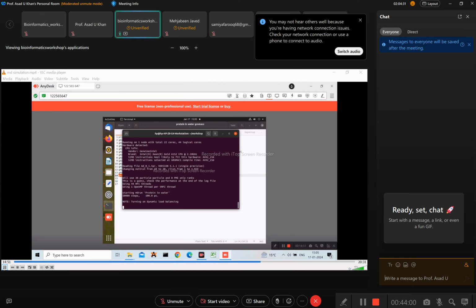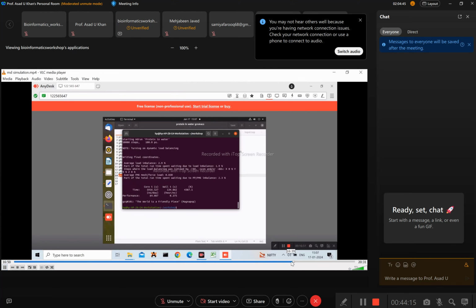It will also take some time. So yes, now it is completed.